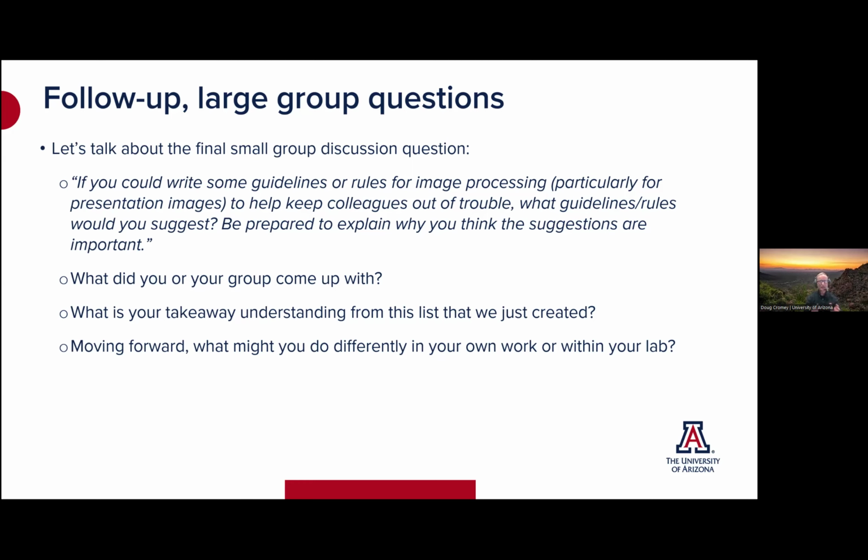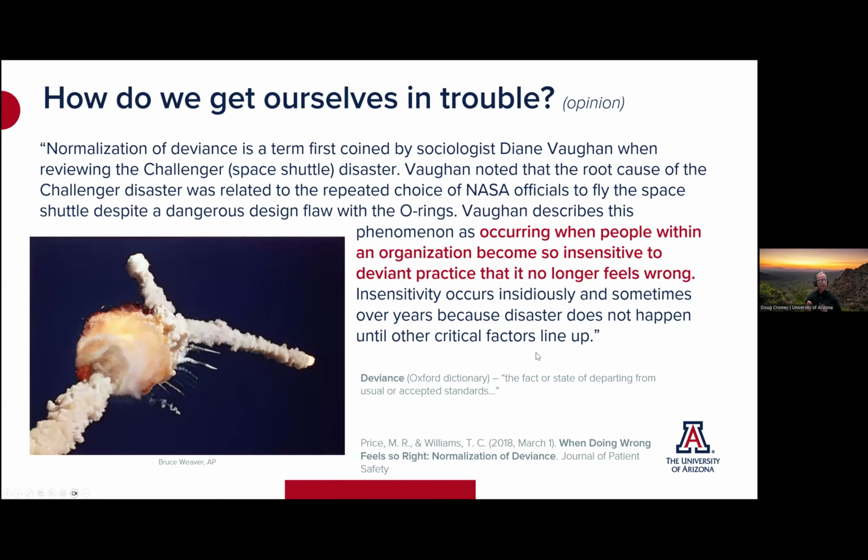So there are a lot of things that are inappropriate for scientific images because we try to make them look nice, but that's when you treat it as a picture and not as data. Let me go to this final slide here.